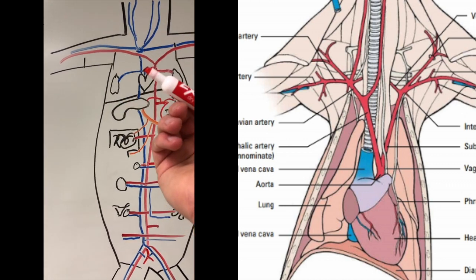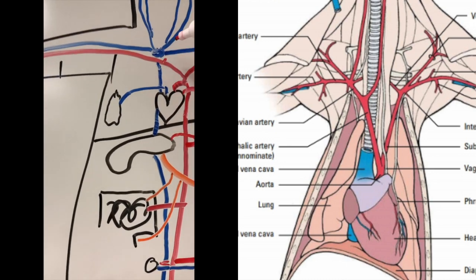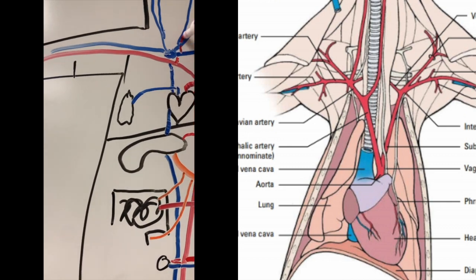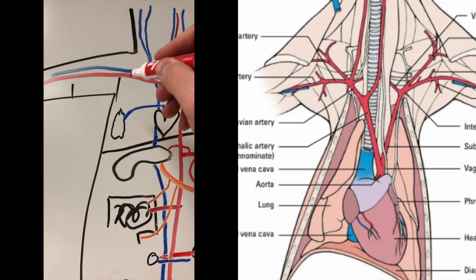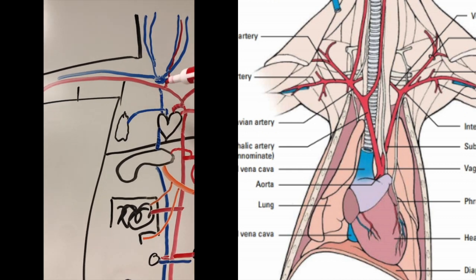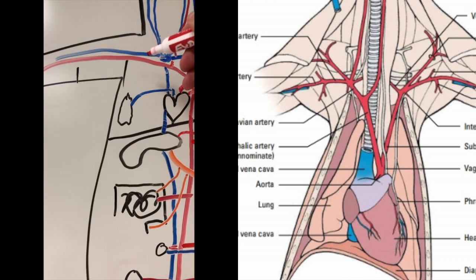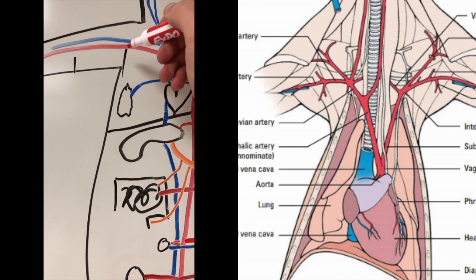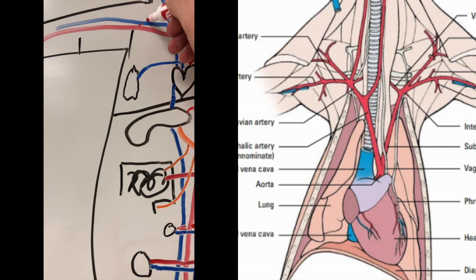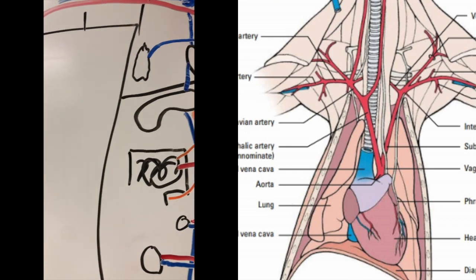brachiocephalic artery right there. So go ahead and depict the first one, branching off right here, right before that brachiocephalic venous trunk. So that branches off right there and follows it up. So the next branch, between the brachiocephalic trunk and the left common carotid, becomes the right subclavian. And then over here, at almost basically where it becomes the arm, is where the other branch, the right common carotid, branches off and joins.